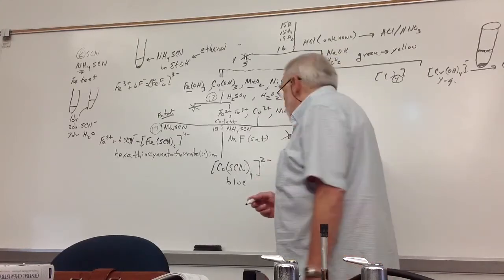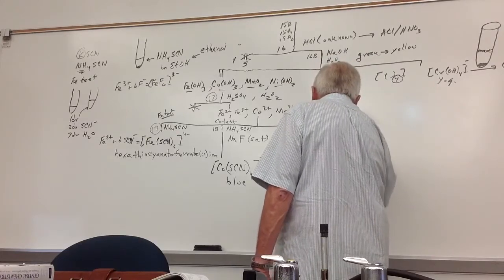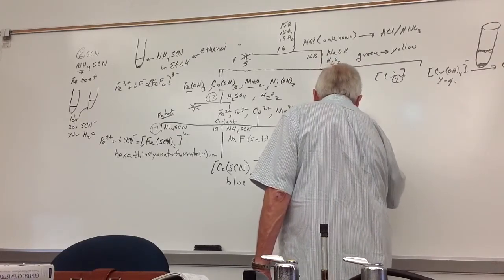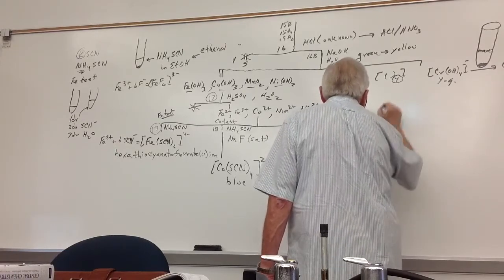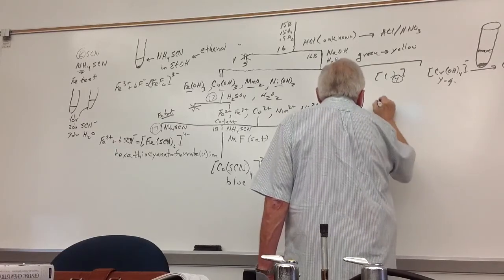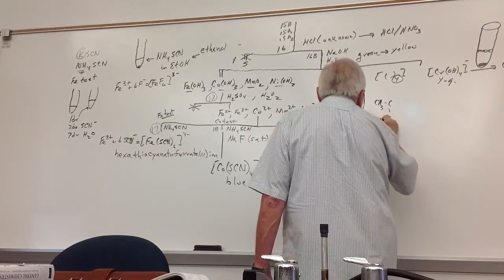Then you're going to add dimethylglyoxime. There's the dimethyl part.